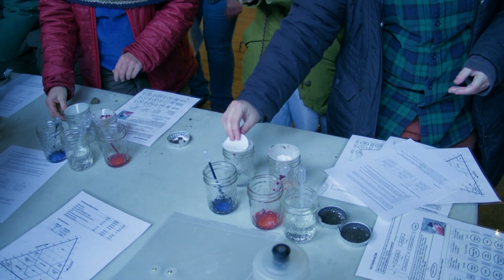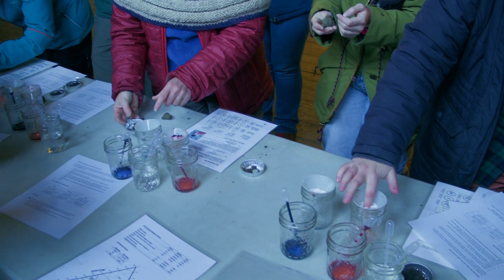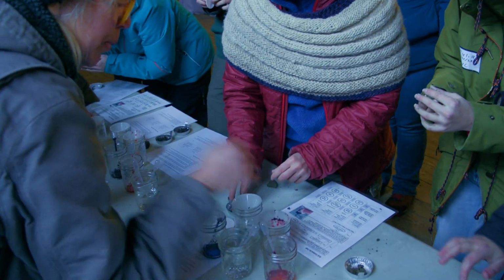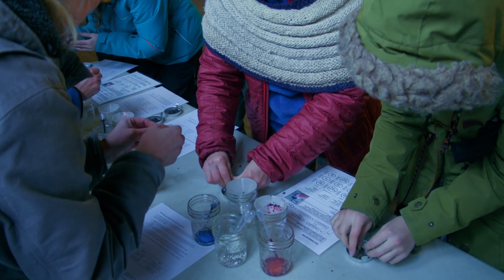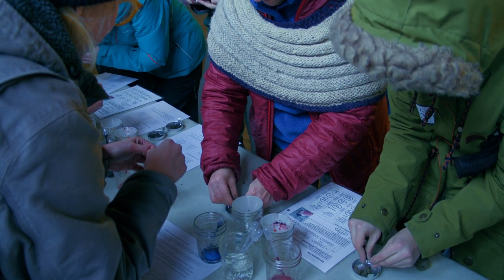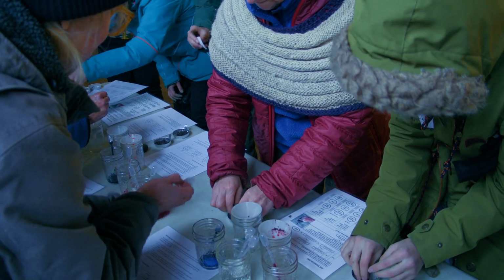20 blue in one and 20 red in the other? How do we prepare the sample? You want to squish this up so that it becomes a little more of a powder. Then you divide the soil in half. Make a small indentation in your soil. Add 20 drops.